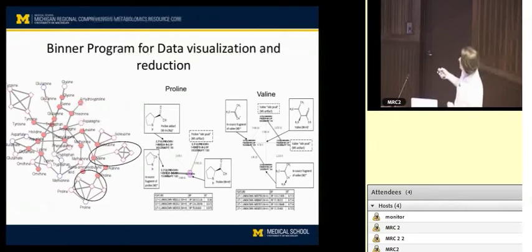So when you do that, you see not only named compounds, but you start to see a lot of unnamed stuff that shows up in a network. I really wanted to get to the bottom of what all this unnamed stuff is, that potentially could insert itself between two of our known metabolites, and that doesn't tell us anything about the biology. In this case, they didn't insert themselves in between, but it's potential that they could.